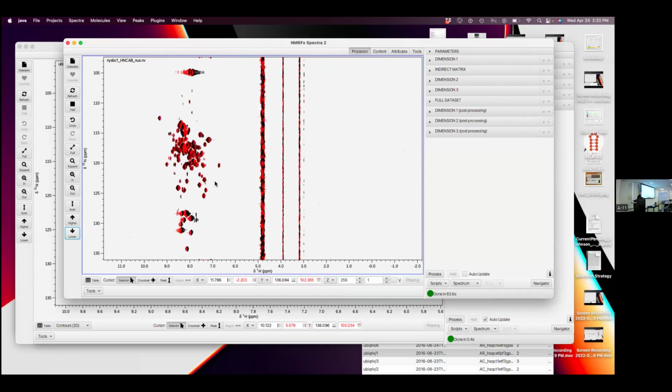Okay, so actually I didn't phase or anything. So I didn't set up the phasing. I didn't want to take the time. But you can see it basically processed that. I didn't get rid of the water because the auto generate script doesn't introduce the solvent suppression. I didn't introduce the extract and take out. And it's actually important for NUS processing. You're basically processing each one of these planes for the NUS process, and there's no reason to be applying that to all these planes over here. So this is a good reason to sort of just extract the region that you want in your direct dimension.